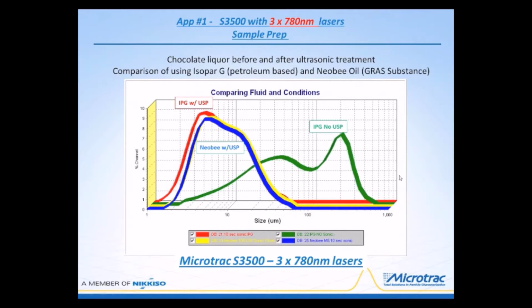So we can use lots of different fluids, and the different organic compounds include all organic solvents. The system is designed for dealing with them because of the glass. The system is glass, Teflon, stainless steel, and solvent-resistant fluoropolymer O-rings.